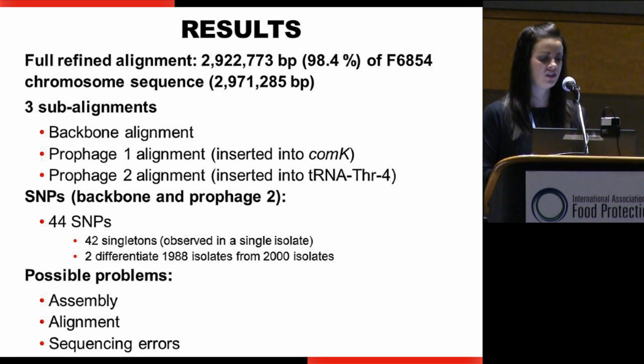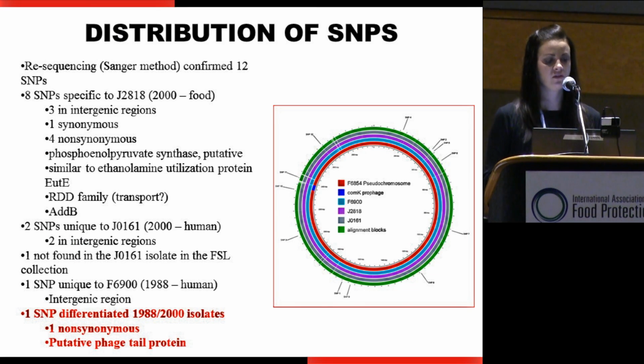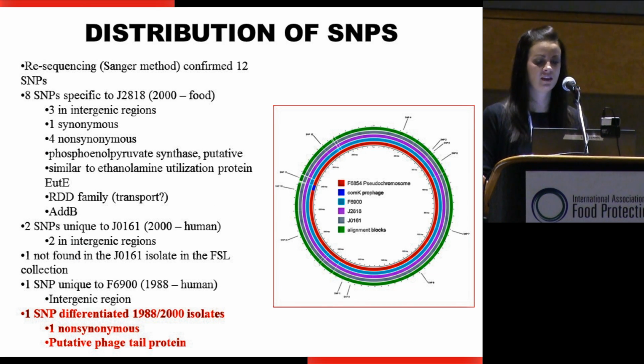So looking at the genomes, there were about 40 SNPs, or single nucleotide polymorphisms, observed in a single isolate, and most of these SNPs were actually found to be an artifact of actual errors of the sequencing. When we look closely comparing the genome sequences of these isolates that were associated with this plant, that are highly related, there were only 8 SNPs.